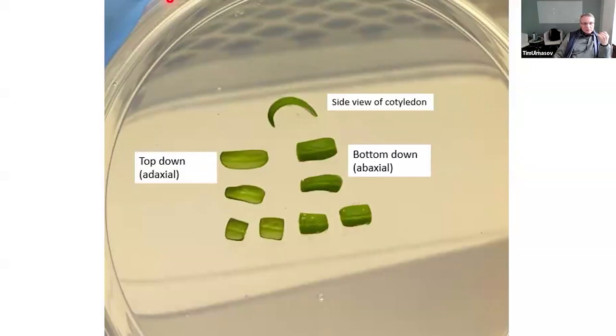That's a very important detail. I've done a quick Google search. Is it micropore tape 1530-1 or any specific brand? I believe that is, we use the 1/2 inch. So I don't know, I think that's the number, but honestly, I'd have to look if that's not.